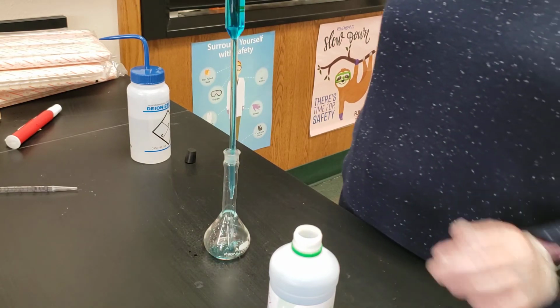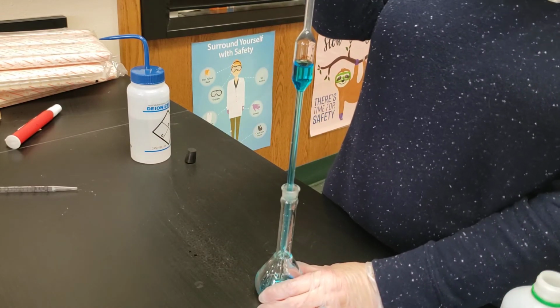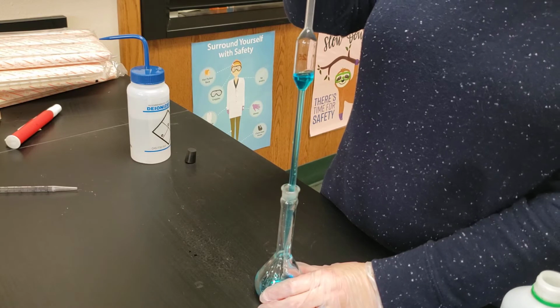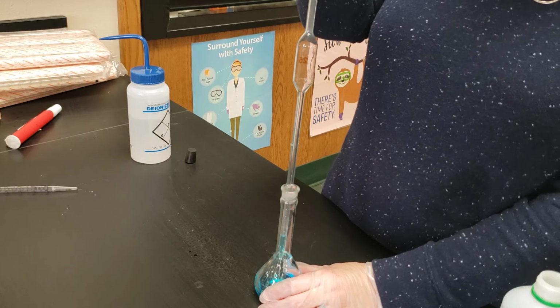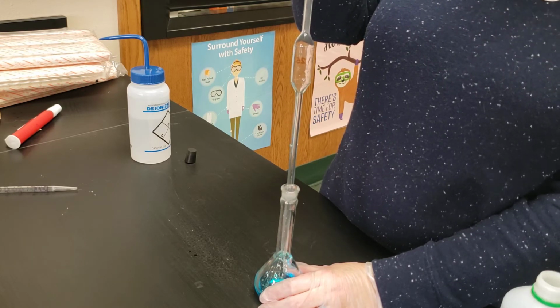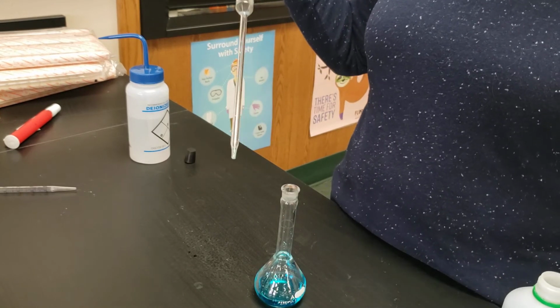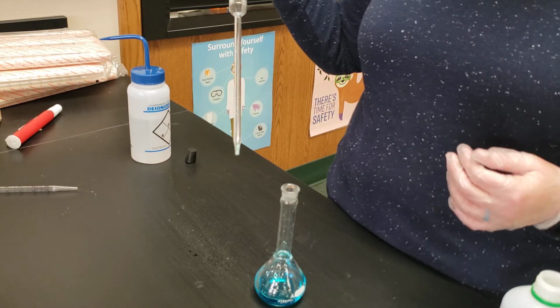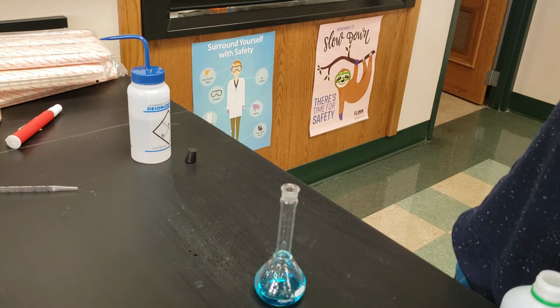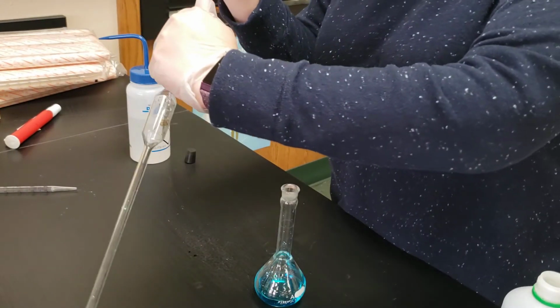I'm going to let that out into my volumetric flask. Now, if you remember, a volumetric flask measures one volume really accurately. So this is a 100 milliliter volumetric flask. When I'm making liquids like this from other liquids, I can just pipette the liquid into the volumetric flask, unless it's an acid. If it's an acid, I need to put a little bit of water in there so the acid doesn't splash back. At the bottom of my pipette, you may notice a little bit of liquid left in here. The pipette is designed to do that, so we don't put that in, okay?